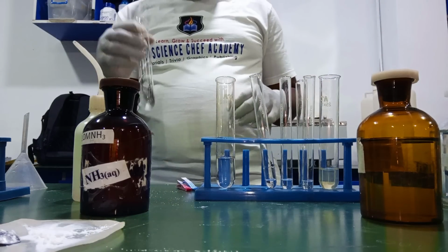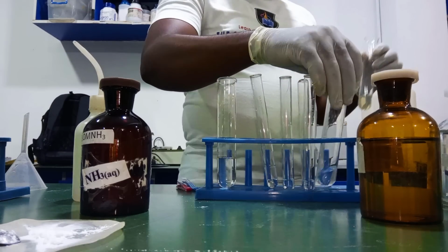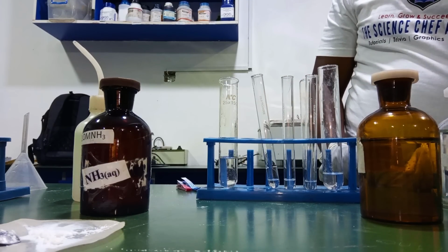All right. So we are done with our freshly prepared FeSO4. We don't need it again. So let's do away with it.